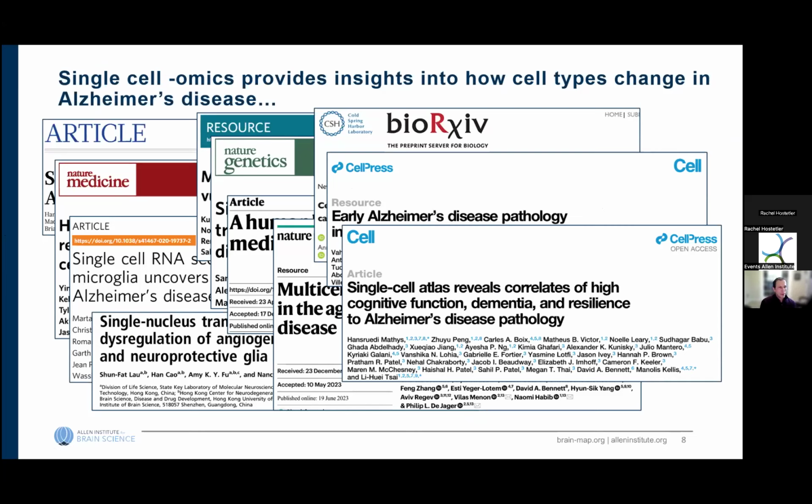So this is 8 UMAPs from 8 of these different studies, where the names of the cell types are shown, and even things at the level of excitatory neurons. This study calls it EX as the abbreviation. This one calls it EXIT. Some of the other ones call it EXC. For the higher resolution ones, you see ones that are just numerically ordered. This study uses gene names, and some have higher versus lower resolution.